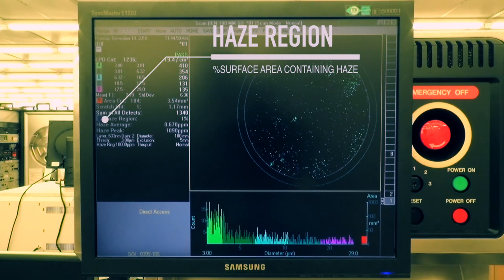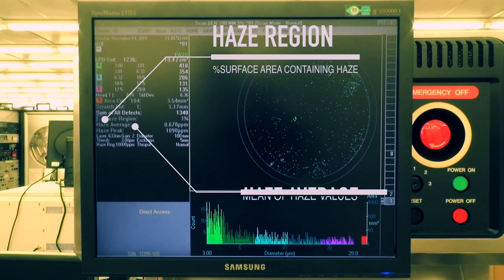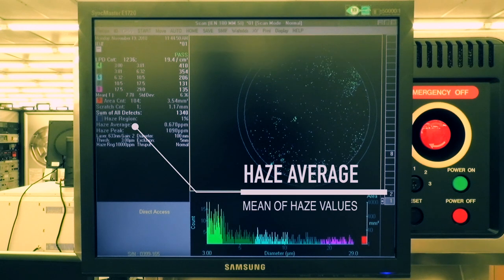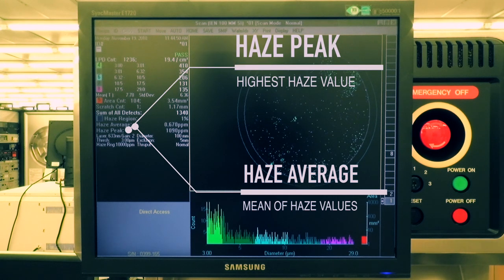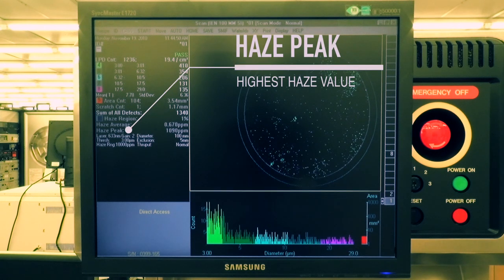The haze region represents the percentage of surface area that contains haze. Haze average is the sum of all haze values divided by the number of haze values. Finally, the haze peak is the highest haze value.